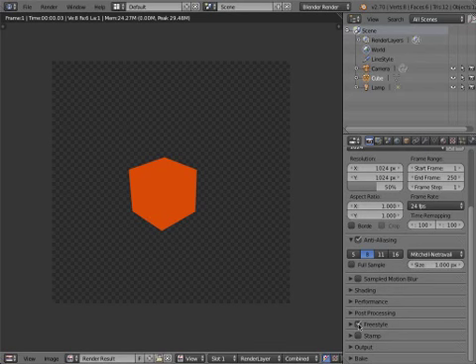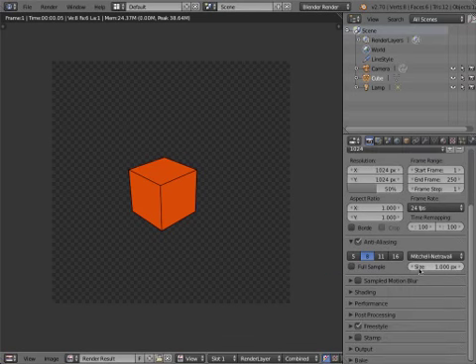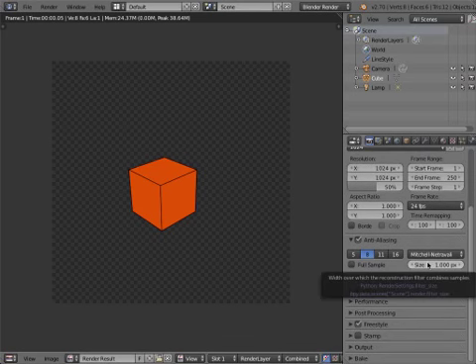But I mentioned the renderer called Freestyle. So if I switch that on, you can see now we've got this comic-like stylized cube. And that's actually very good for scientific visualizations. It looks like a pretty good high-quality visualization straight away. So if you just go into your Blender, try to change your material to some color, and click on Freestyle, and then render it out. Then you should all get an image kind of like the one that I have here.